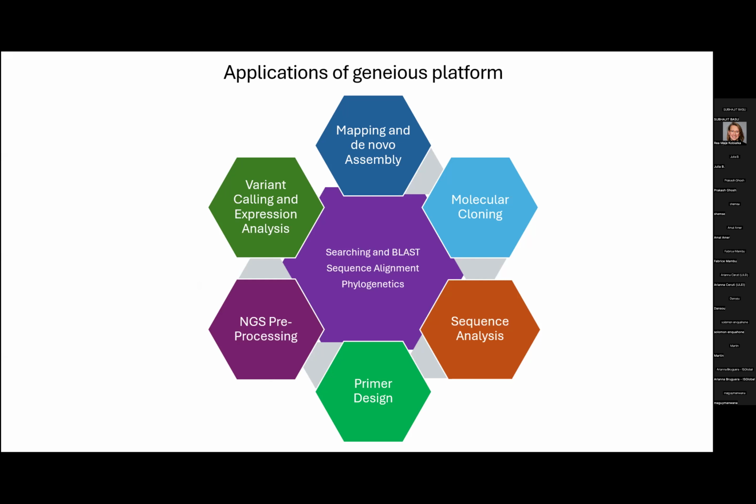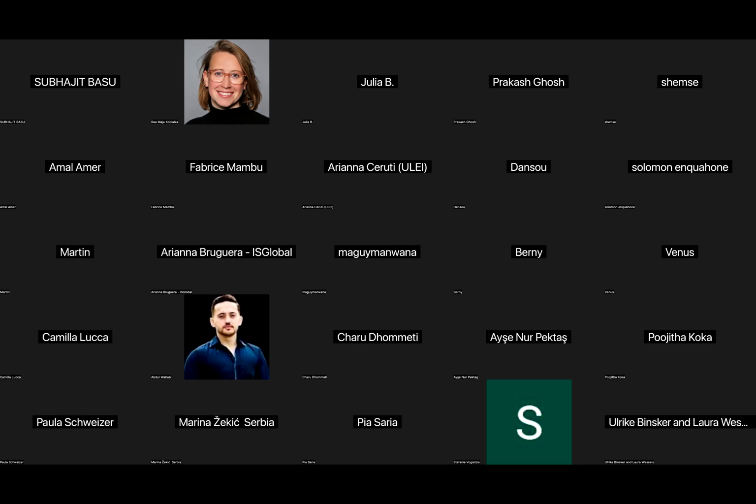There's a variety of tools that you can use with the software. I'm going to show you 3 different ones that we use normally, that are really simple and really useful. One is primer design, BLAST, and alignment mapping, and de novo assembly, which is something that's really popular, right? You can also use all other tools, like building a phylogenetic tree, so all kinds of different stuff. I'm going to show you the software in a minute, so you can have an inside look.